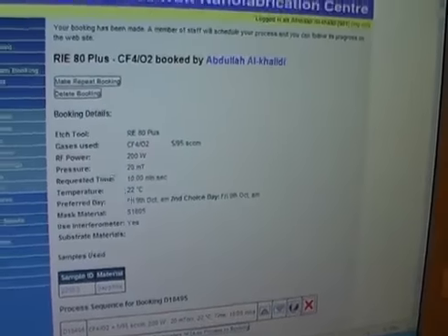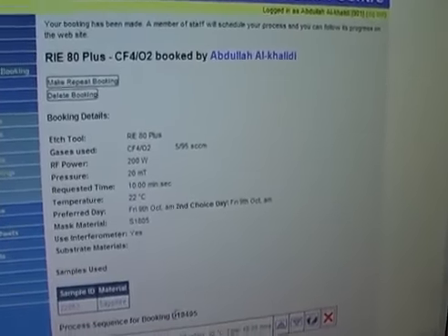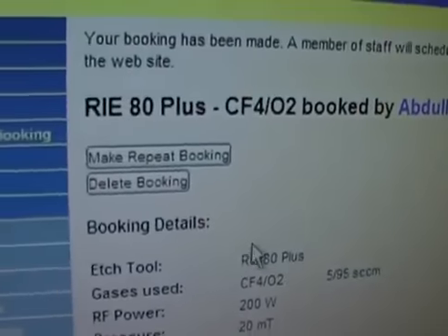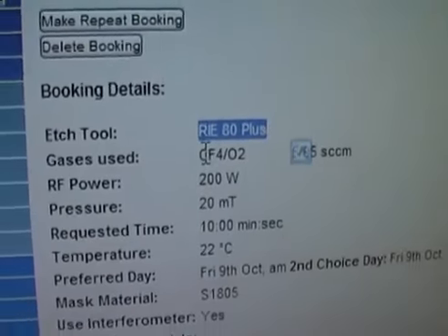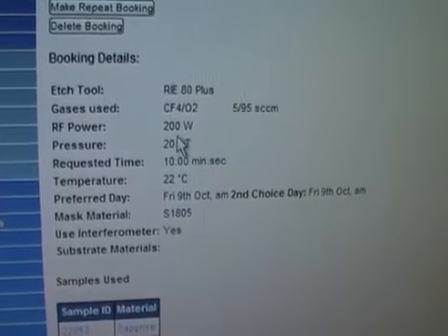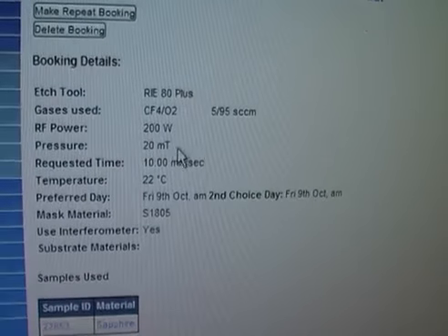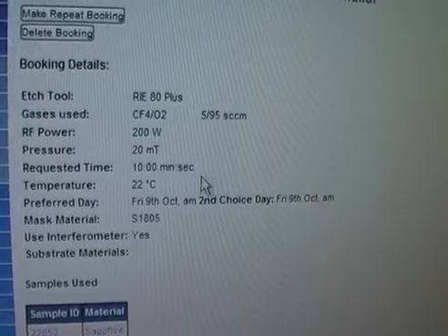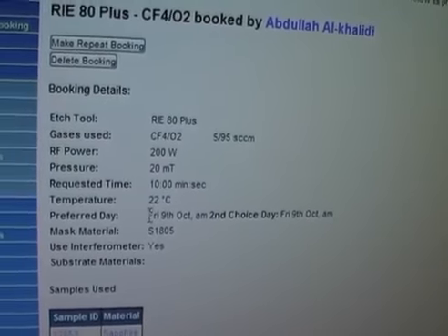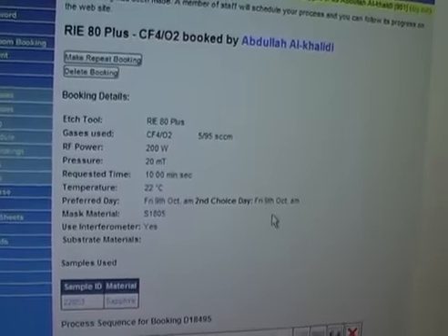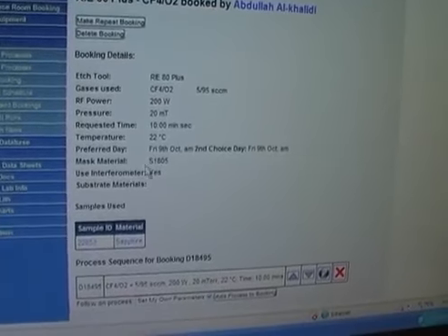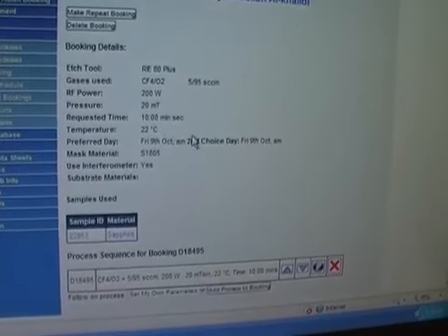We now have the booking number D18495, and we can review the booking details. The tool used is RI-80+. The gases used are CF4 and O2 at 5 and 95 SCCMs respectively. We have the RF power, pressure, and the requested time of 10 minutes and 0 seconds. The temperature is 22. The preferred day is Friday AM. For the second choice we left it at AM, although we should change it to another time to give the operator a chance to schedule the booking.